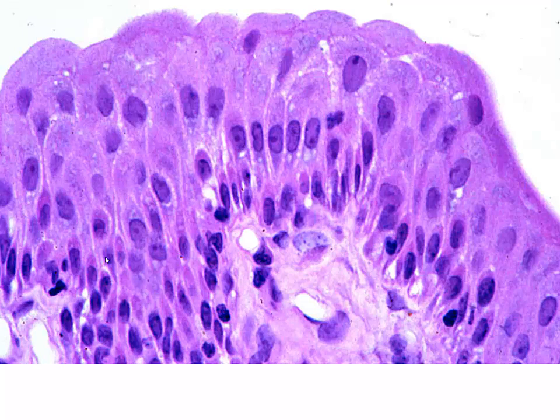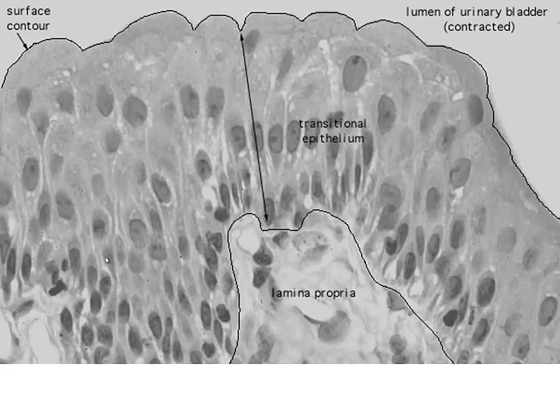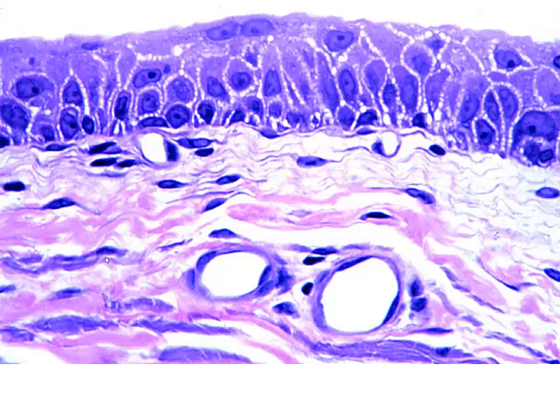And then another more close-up look at our rounded dome-shaped transitional epithelium. Remember, it's going to look fairly pseudostratified, if not stratified, but when you look at that surface and see those dome-shaped cells, even if you don't see the binucleated cells, that's your tip-off that you're looking at transitional epithelium. Another view there, we can see in the very center at the top our binucleated cells, characteristic of transitional. And then we can see our submucosa connective tissue.